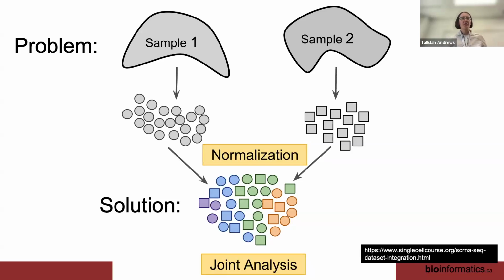So this whole lecture is based on integrating your data. So this is the case where for our modern day single-cell RNA-seq data sets, one sample isn't enough. We've got to have multiple samples across multiple conditions. So how do we work with that?